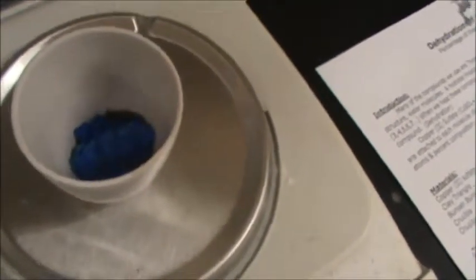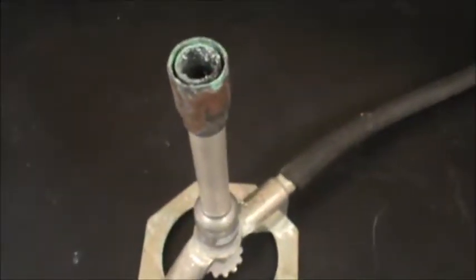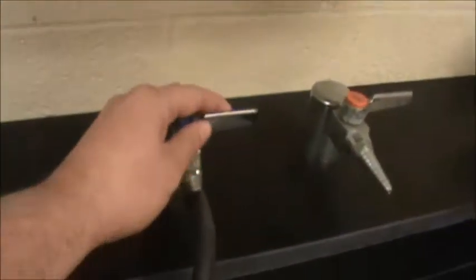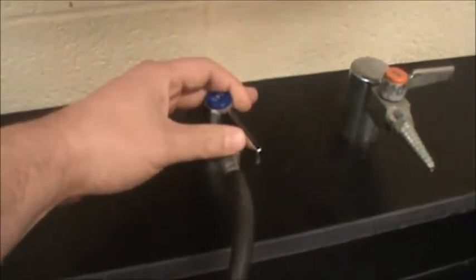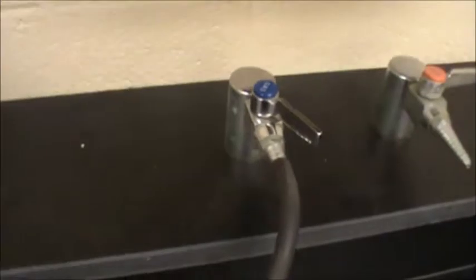And now we're going to start cooking. I have my Bunsen burner. It's slightly dirty, as you can see at the very top of it. I have it connected to my gas valve. My gas valve is a ball valve. All I have to do is crank it towards myself and it's full blast. I don't want it to be too high, so I'm going to turn it down just a tad until I barely hear it hissing. Alright, so I got my gas here.